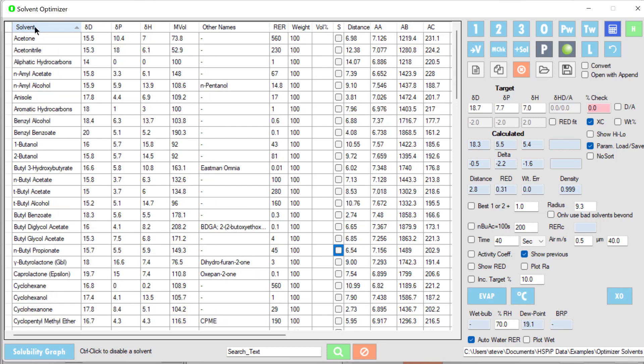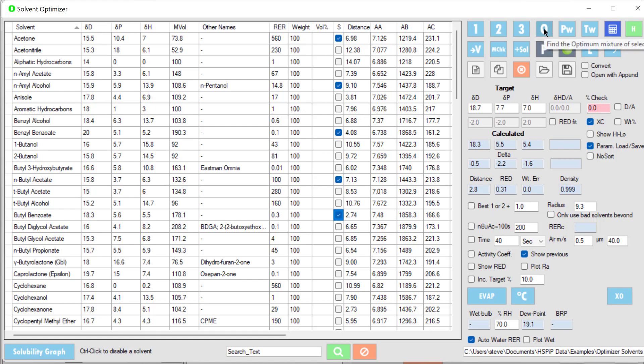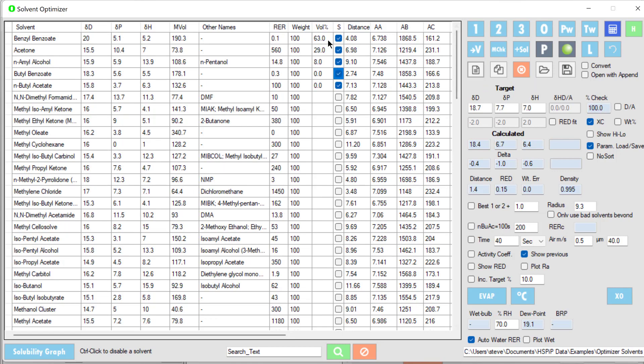Resorting by solvent and selecting a few solvents at random, I'm just doing this purely at random. What combination of these five solvents would be best? I hit the O button and it tells me that a 63-29-8 blend of benzyl benzoate, acetone, and n-amyl alcohol is quite a good match with a distance of 1.4. So I can do all sorts of optimizations.